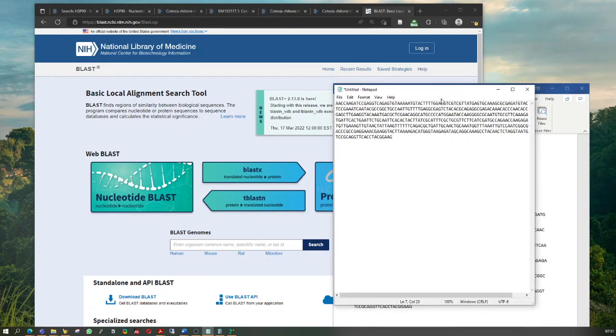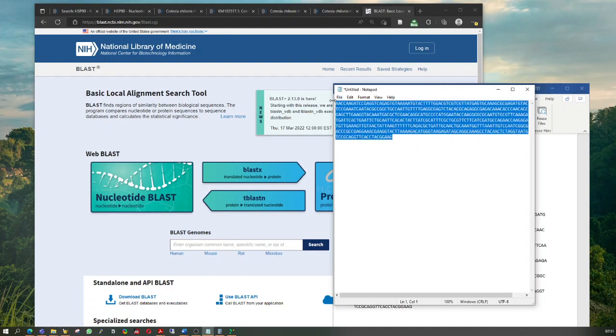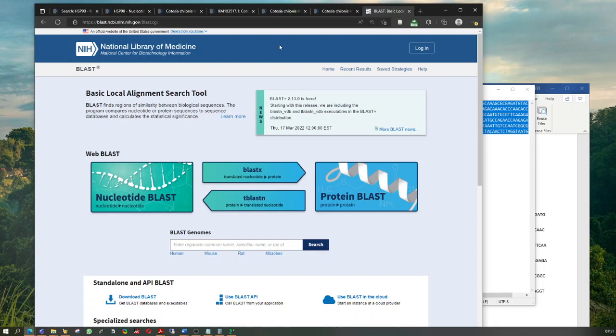people are dying, they're showing some bacterial infection symptoms. All you have to do is have the sequence. It's also not a sequence from the entire species, just the last fragment, but that can allow you to do ID. So this is where BLAST comes into play. It's a basic local alignment search tool. So what it's doing is running your sequence in a specific database, and it's going to align it to every single sequence that exists there to give you some feedback so you could have an idea of what you are looking at. So let's just click on it.